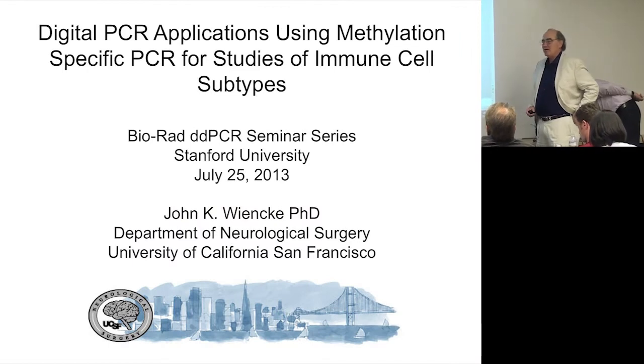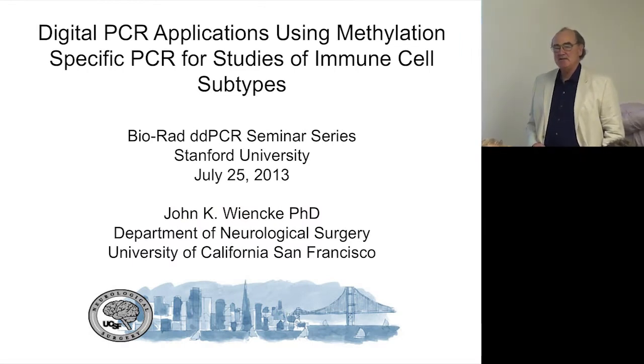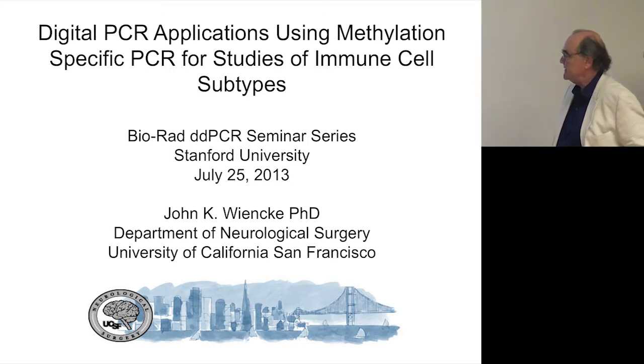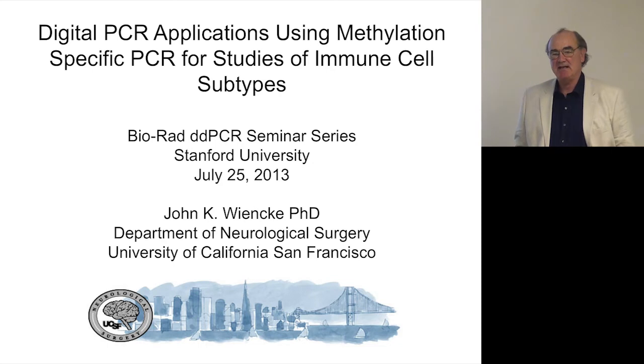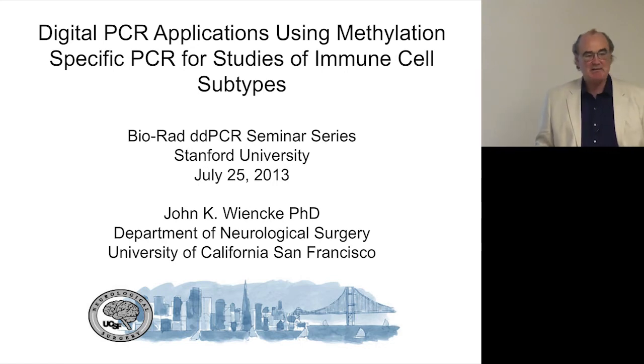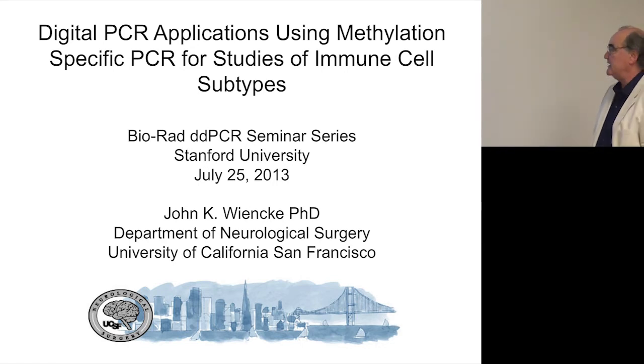I'm going to talk about our applications using digital PCR in terms of methylation-specific PCR. And I'm going to tell you a little bit of the background of the science and a little bit of history as to why we're excited about the technology and why we're doing methylation analysis on blood cells.